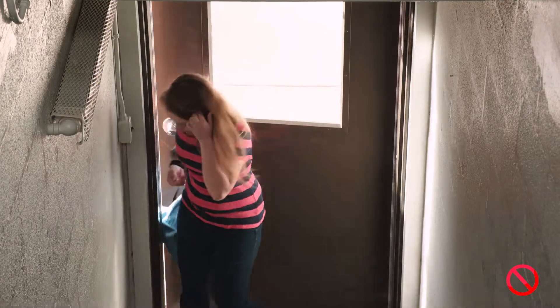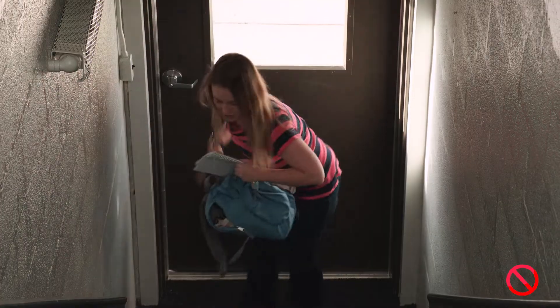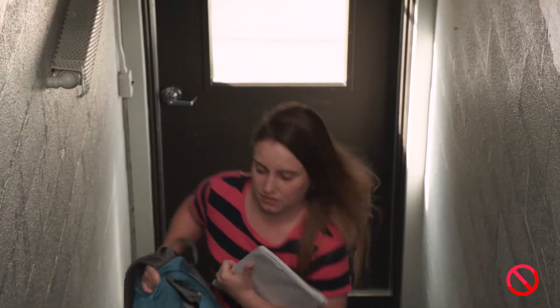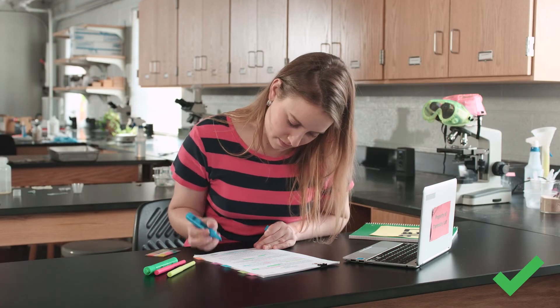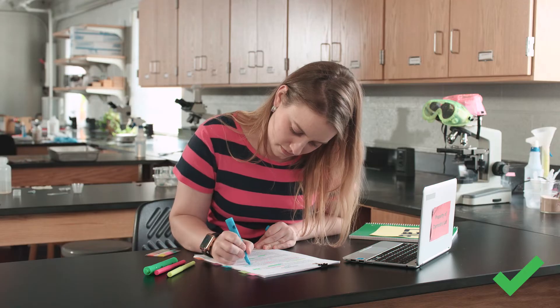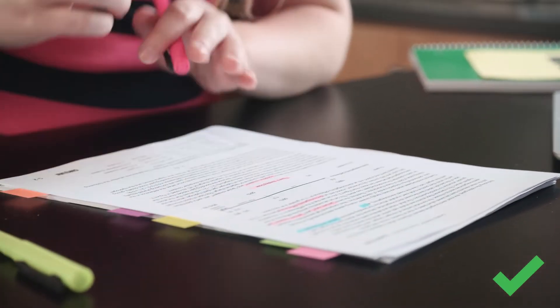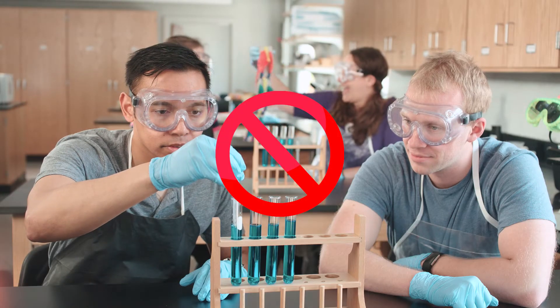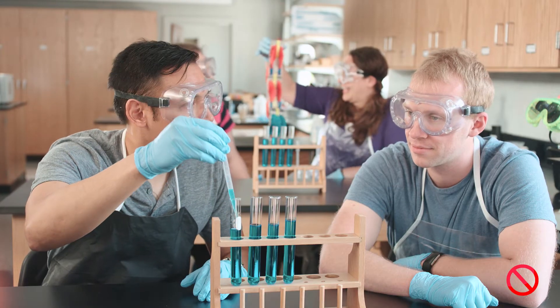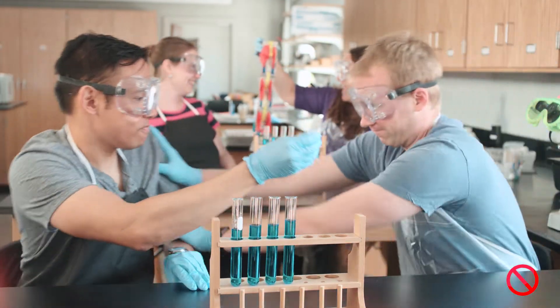Prepare the lab by reading the instructions and safety information ahead of time. Always pay attention to the work. Don't fool around in the lab — no horseplay, pranks, or practical jokes.